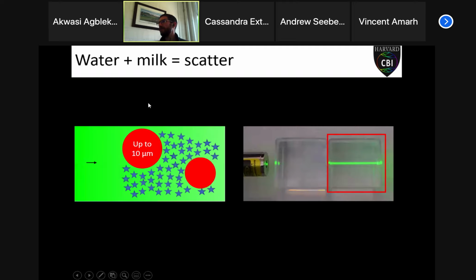And the major difference here is that those lipid molecules and protein complexes are really large objects that are sitting inside the solution. So we have all these water molecules that are nicely packed in tight to one another, but all of a sudden they're interrupted by these really big blobs of lipid and protein.